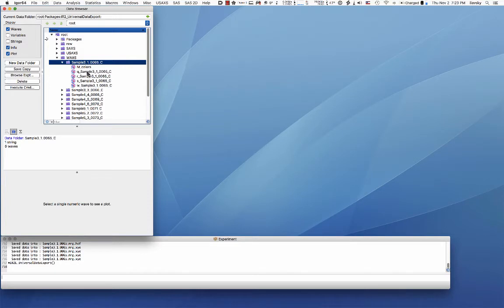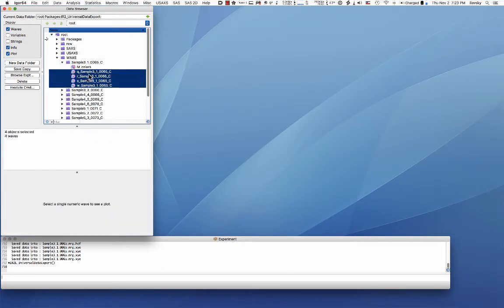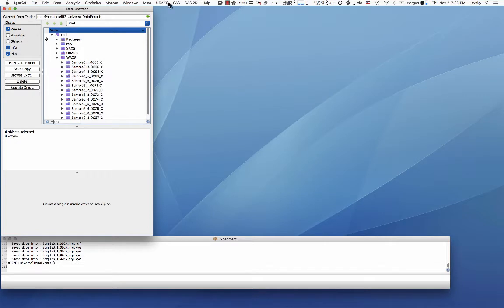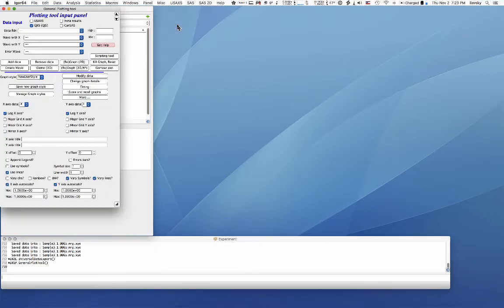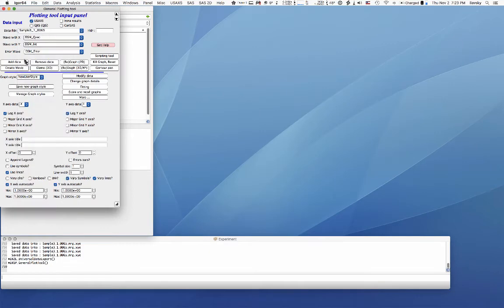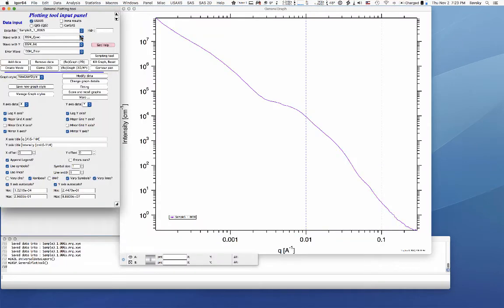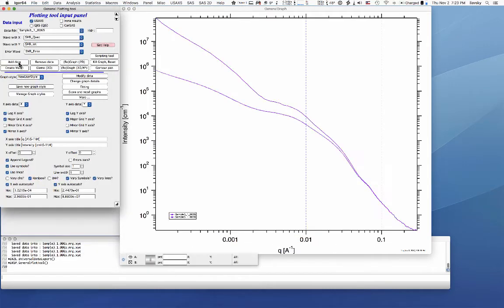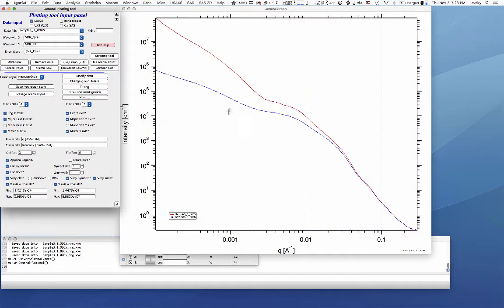So these four waves now contain the same data and in IRENA the way this is recognized is by going here and checking these check boxes. So you have USAXS data and you would have for example this and these are de-smeared data in USAXS. You can put also their slit smeared version in there and let me just recolor that.